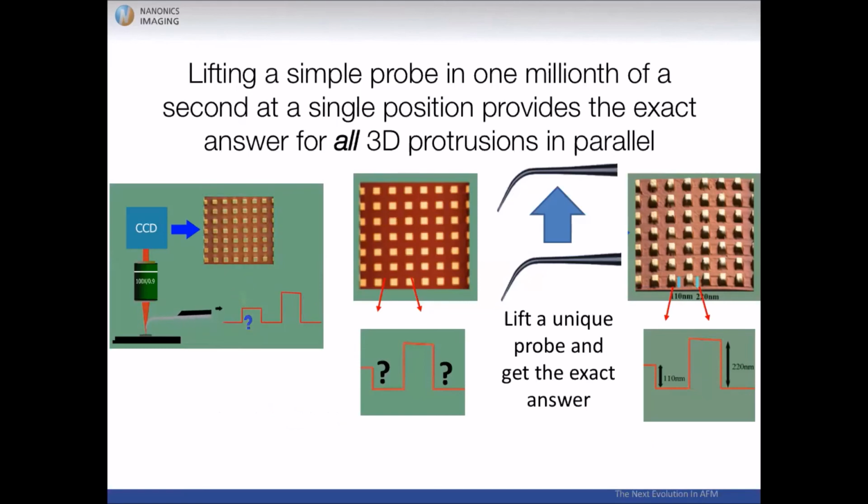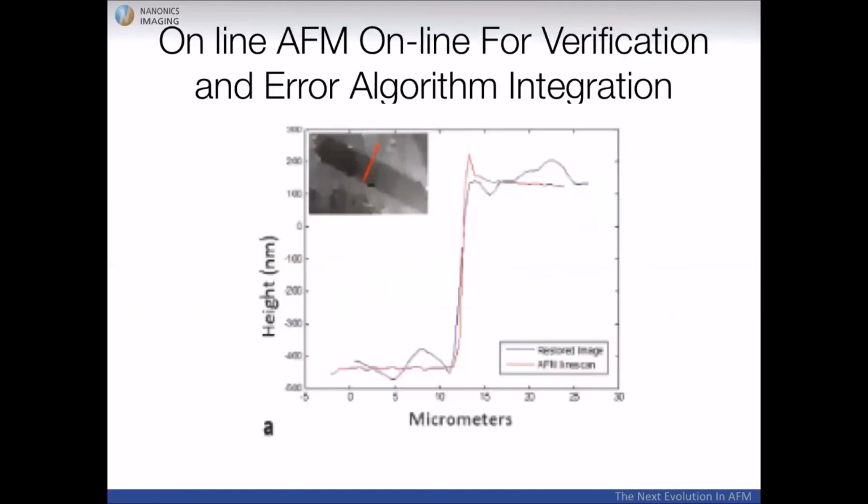In addition, and this is a thing I made for Near, okay? As you move your probe up and down, there's another problem in holography, which is called the 2-pi ambiguity problem, okay? And as you move the probe up and down by nanometric precision, you have a very good ability to try and resolve that problem of 2-pi ambiguity. So both the twin image problem and the 2-pi ambiguity problem have a chance to be solved. In addition, what is seen here, in terms of an edge, for example, is well reproduced because you have an AFM which can check whether you are right or whether you're wrong.